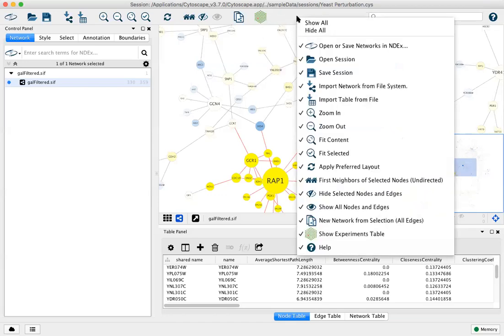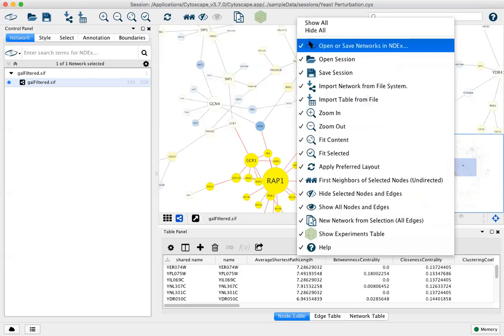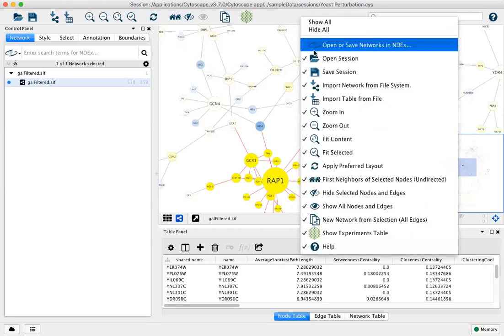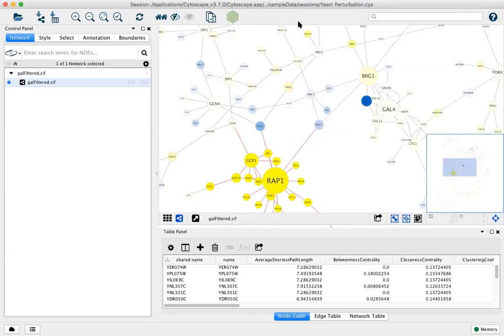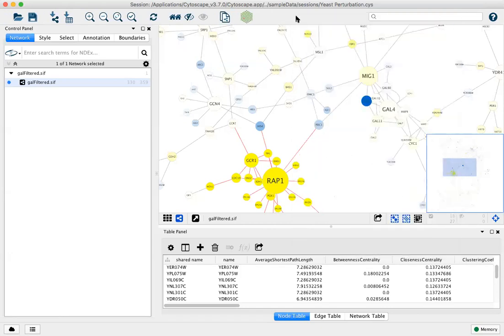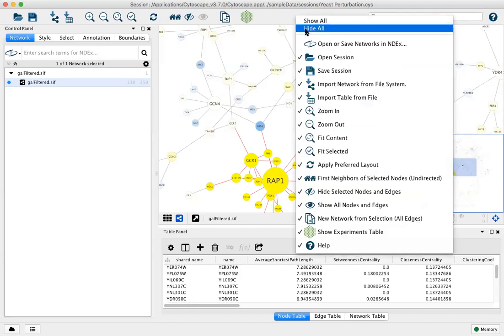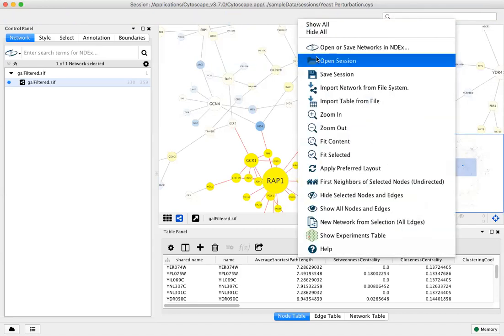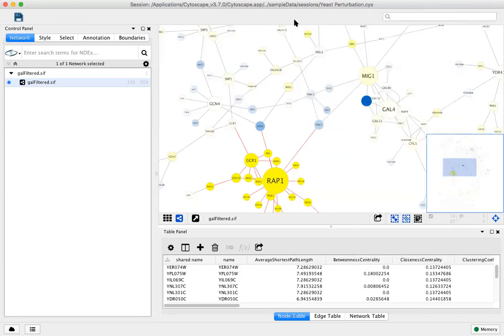If you right-click on the toolbar, you can remove individual icons, add them back, or hide them all and just add the ones you use most frequently.